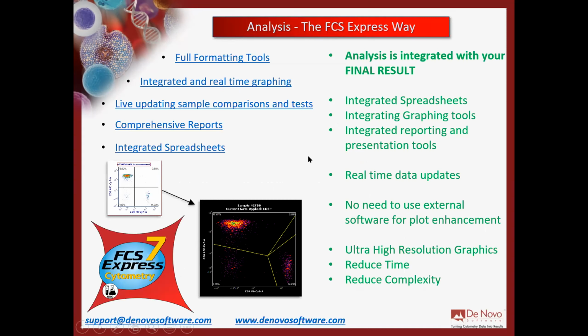What you're going to see today, I'm not going to go through all of the stuff I have here for these little application examples, but keep in mind that your analysis is always going to be integrated with your final result in the software, either through spreadsheets integrated in FCS Express, graphing tools, or reporting, getting all of your figures ready for publication. We have ultra high resolution graphics.